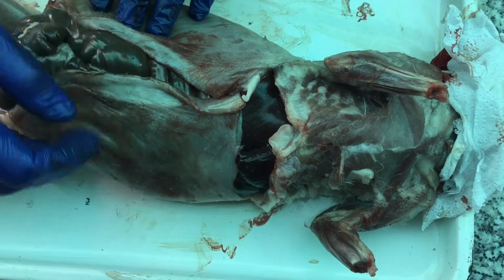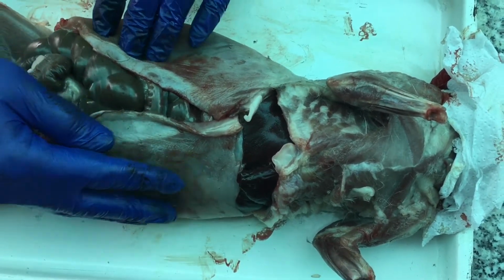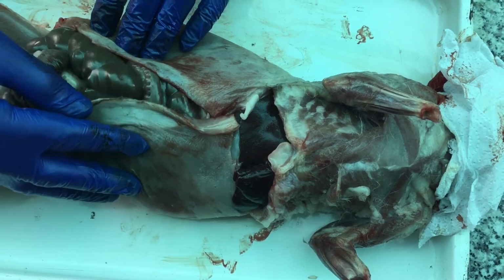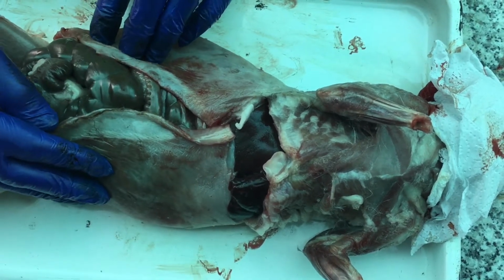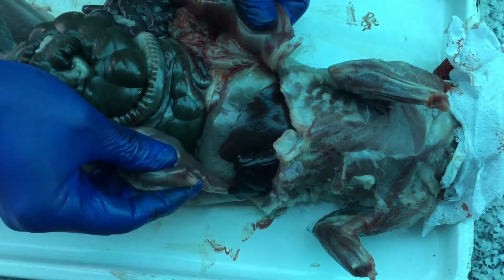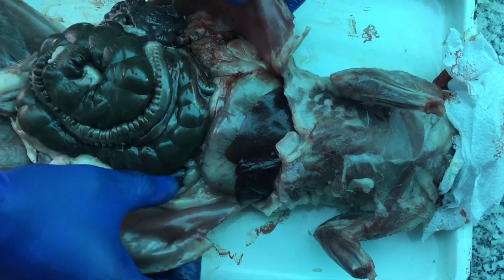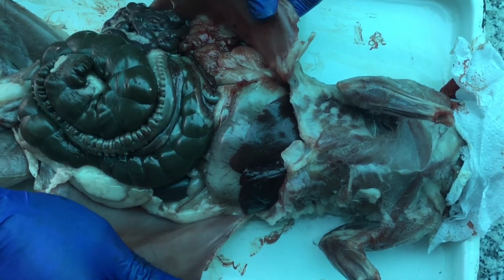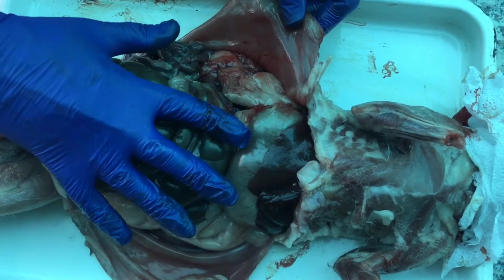Okay, so once again, we're using our rabbit, recently slaughtered and skinned, as a nice surrogate or model for the basic organizational plan of a mammalian body, including a human body. And what we've done is cut through the outer muscular tube of the body down here in the abdominal region and opened up the coelomic cavity, or in the adult we would call this the abdominal cavity, to see all of the internal intestines, the liver, the stomach, and all of that.